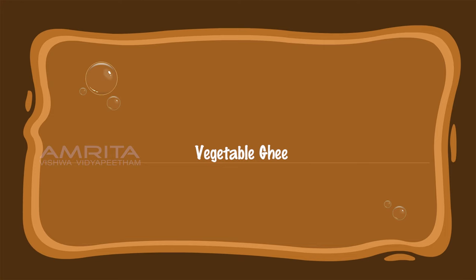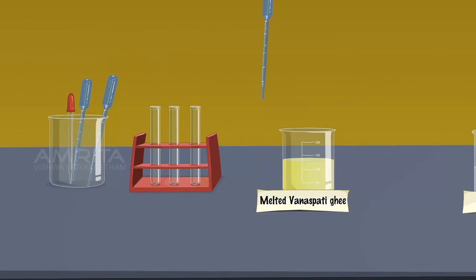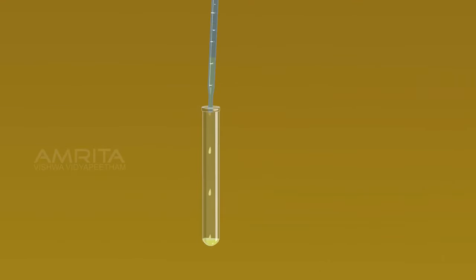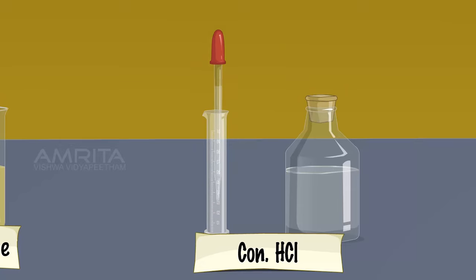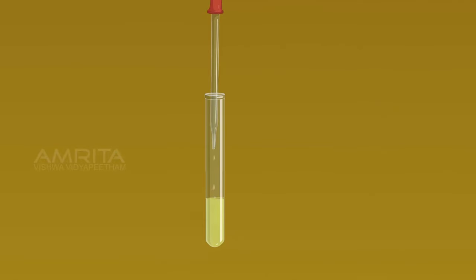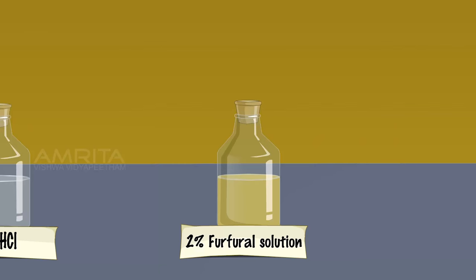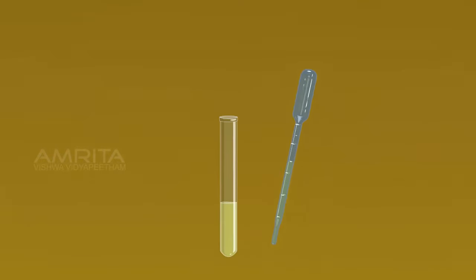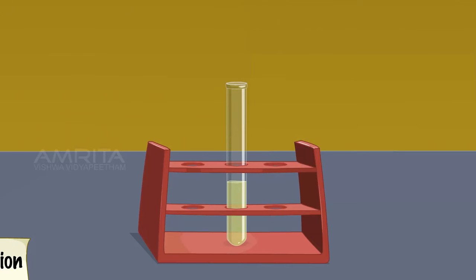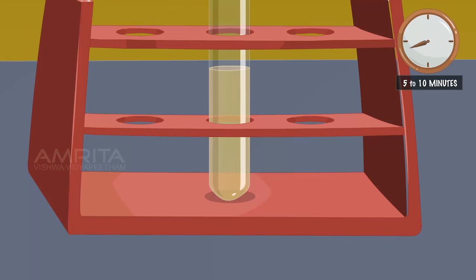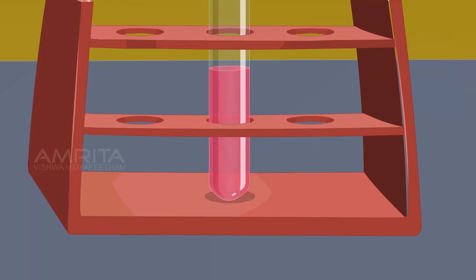Baudouin Test — Vegetable Ghee. Using a dropper, take a small quantity of melted vanaspati ghee in a test tube. Using another dropper, add 5 ml concentrated hydrochloric acid into the test tube. Then add about 3 drops of 2% furfural solution into the test tube. Keep it aside for 5-10 minutes. A rose red colour appears, indicating that vanaspati ghee contains sesame oil.